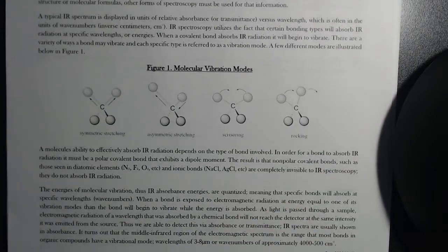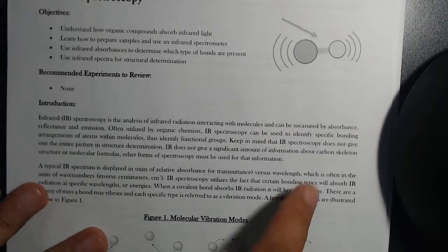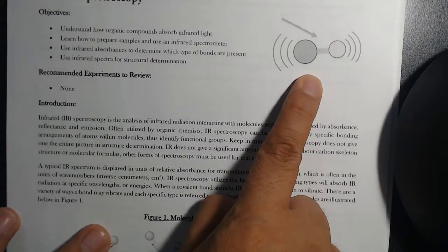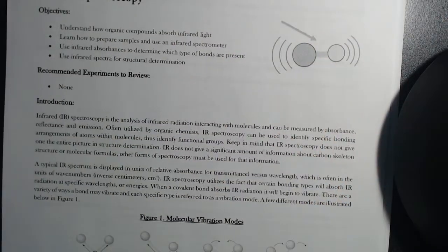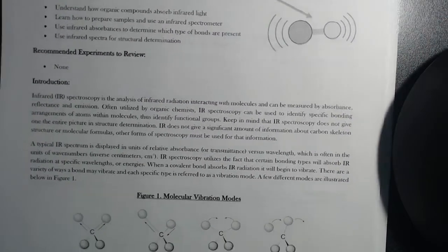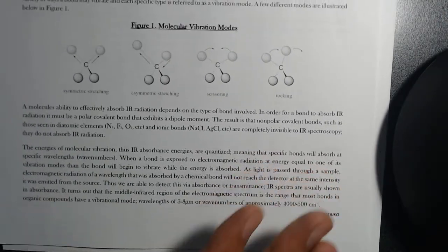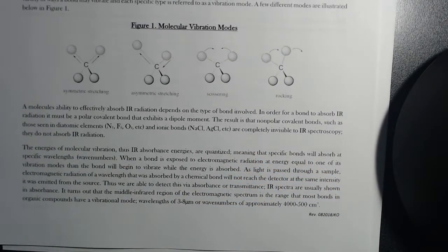All right. Going back to the IR, here's a little illustration of what's happening. Basically, your light comes in, it can hit a bond and cause it to vibrate, and that is called absorption. We can measure these absorptions. It turns out that every possible variation of how it could vibrate corresponds to an absorption. My point here is that there's not always a direct correlation between the number of signals you're seeing and how many bonds to H there are, for example.